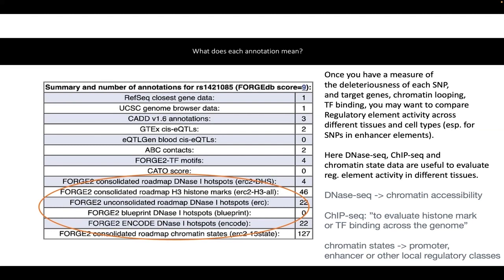Where I come from in Europe, we use the number 10 for scoring things, and I'm sure the French use 20, but I don't know why, but most people use the number 10, which I think is a great number. We decided that because there are 5 independent lines of experimental evidence, each one of them should have a similar scoring, up to 2, depending on how much intensity we have. We have some rationale as to why you would want to treat them differently in different lines of a particular score.